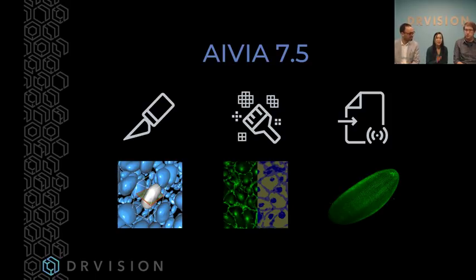All right, so I'm just going to go down a couple more questions specifically for the pixel classifier. You guys have kind of sort of touched on this, but can we teach on multiple images for the pixel classifier? Multiple images, only with the trick that Mike was hinting at. So if you append multiple images on a time lapse, then you can teach on multiple images. But that's one of the features that we currently don't have yet. But we'll add that in due course.